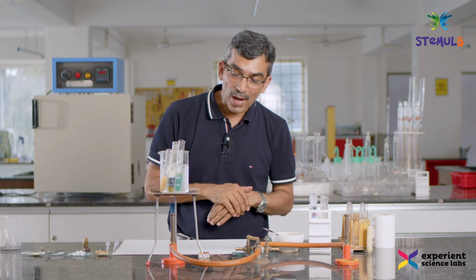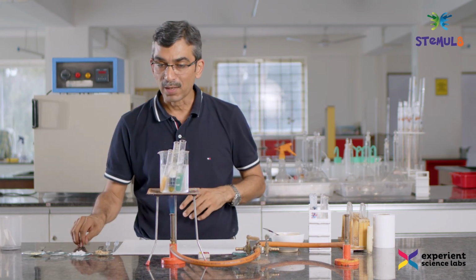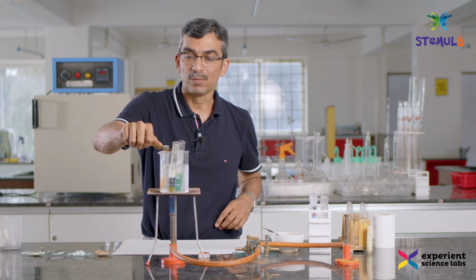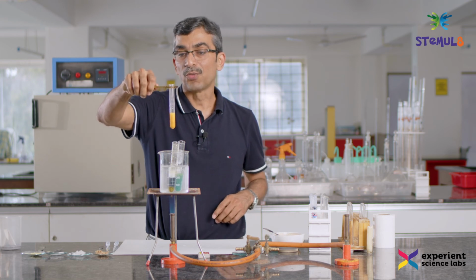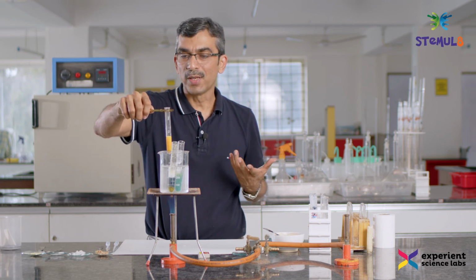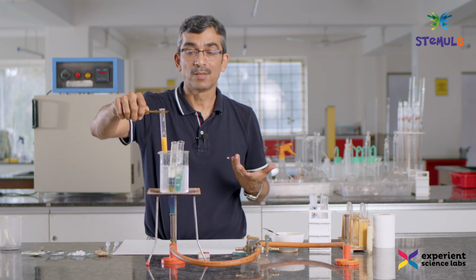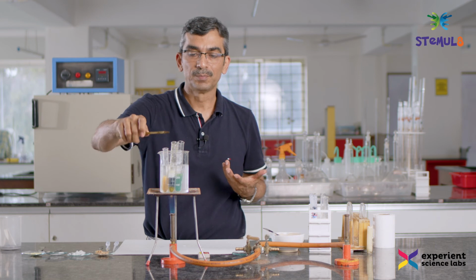Now if you look at our sugar tests, let's come back, and if I have to show you the first sample which we added last, the color has changed from dark green to a saffron, orange color, and it's looking very nice, but that shows that it has tons of sugar in it. There's no doubt about that.